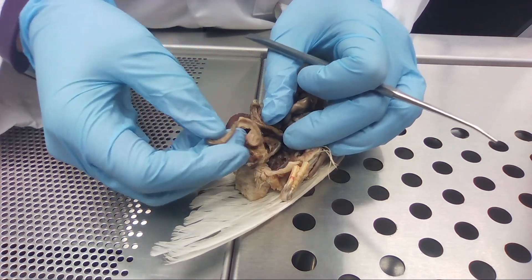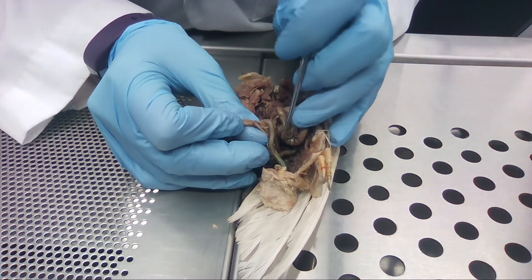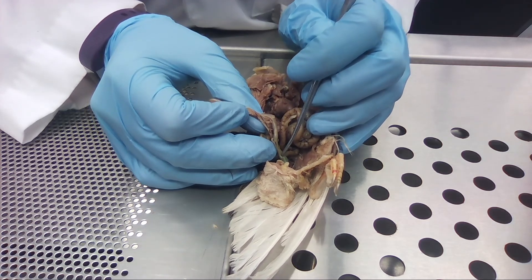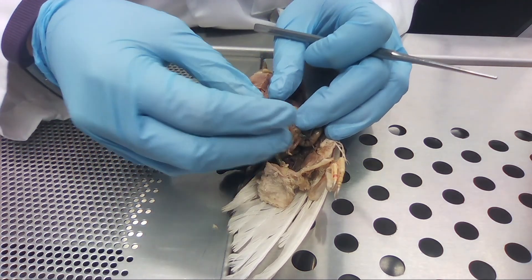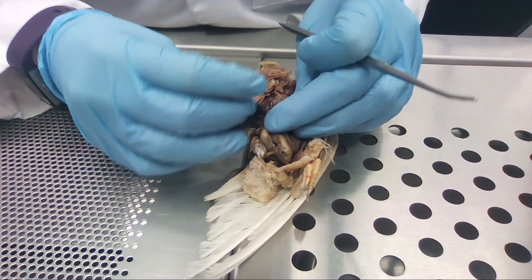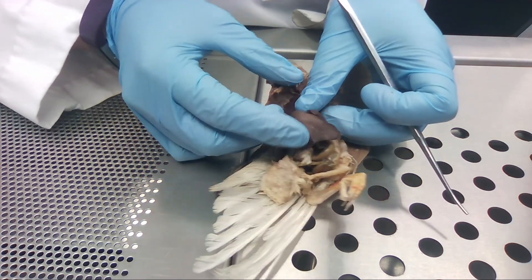It continues down into the large intestine, and down here they have two tiny little buds on either side — those are the cecum. Then it runs out through the cloaca; they just have one cavity for everything — for reproduction and for excretion of waste.